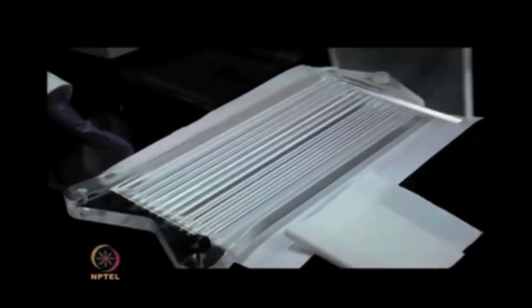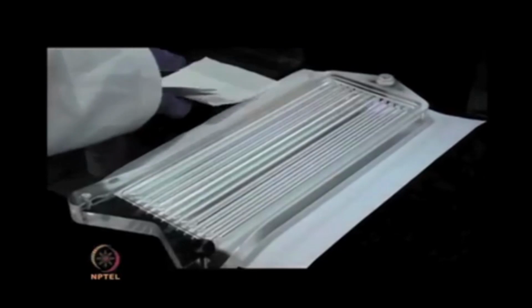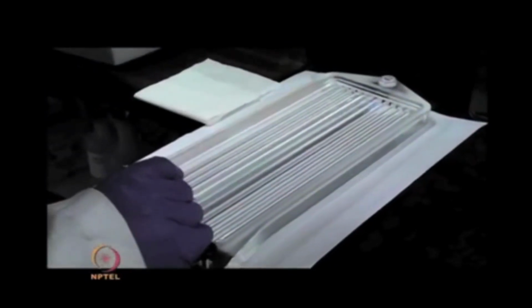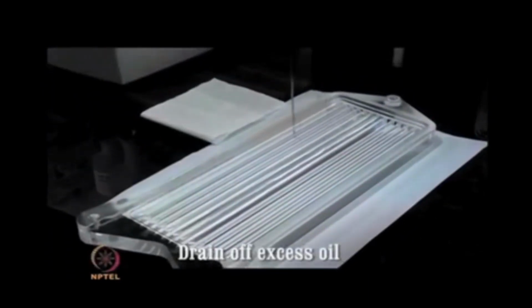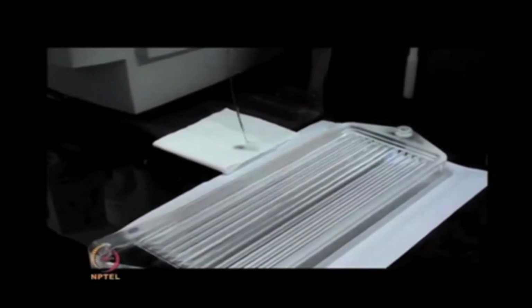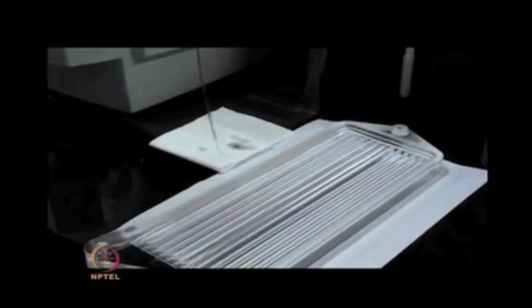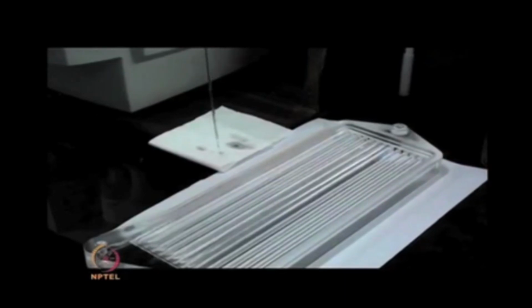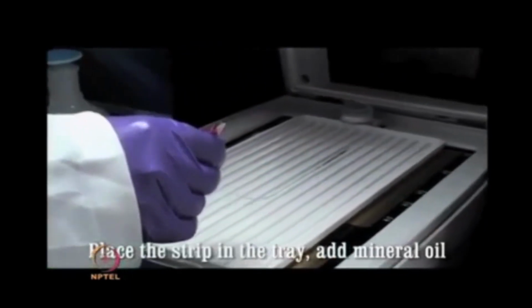Carefully remove the IPG strip from the rehydration tray and drain out any excess oil by blotting it on a tissue paper. Place the strip in the focusing tray and immerse it with mineral oil.